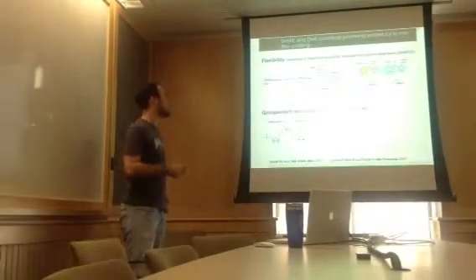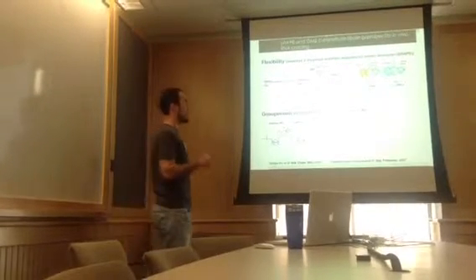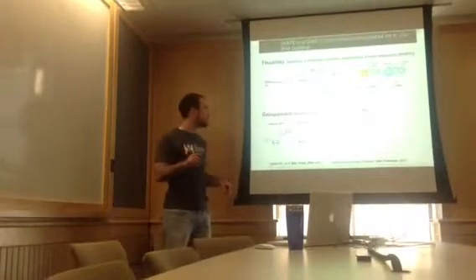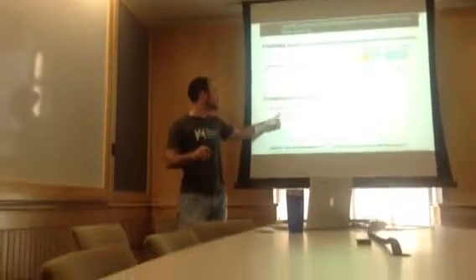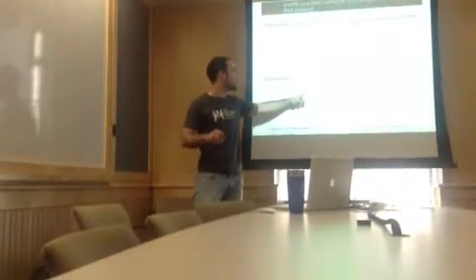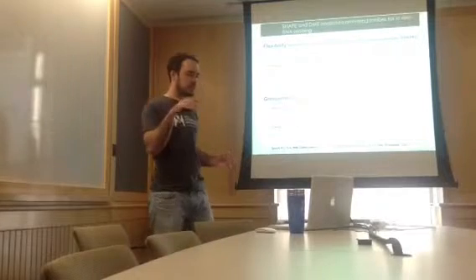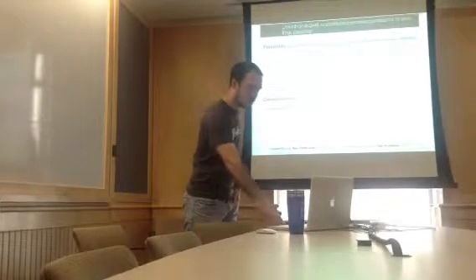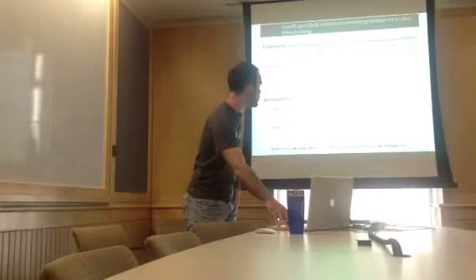And the second compound is the DMS. So the DMS will look at the accessibility of specific groups, and there are two that I want you to remember, which are the nitrogen 1 of the adenine and the nitrogen 3 of the cytosine. And if these are available, the DMS, dimethyl sulfate, will add a methyl group that will also cause the RT to stop during reverse transcription.